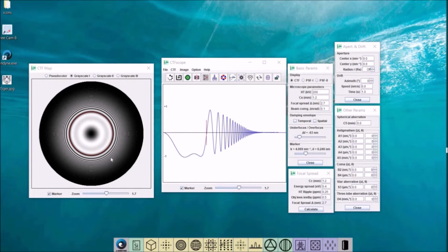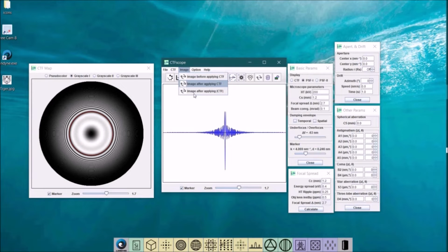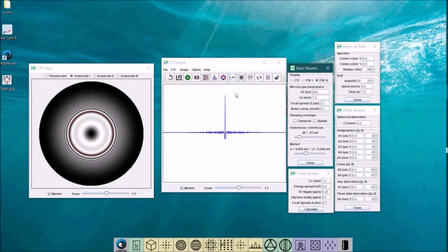For tutorial purposes, we also provide point spread function 1 and point spread function 2. Function 1 is a Fourier transform of the, so you can push here, and you see this is the function. We'll show you with the image how this point spread function works. That will be here, the processing 1 and 2. And for point spread function 2, you see it's much sharper.